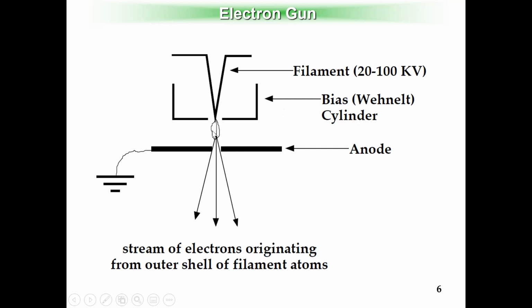So a lot of the time, how we develop the gun source is trying to improve the coherence of those electrons coming out from the tip, right? So there is a shape design, and there is a design of the electric field, so forth, right? The more coherent electrons you can get from the tip, the higher spatial resolution you can get from the final image plane.